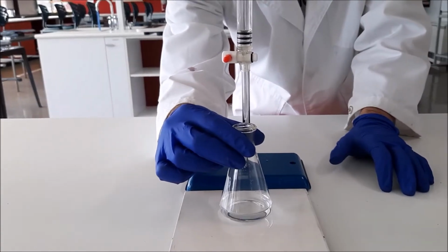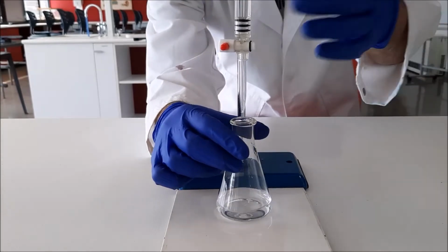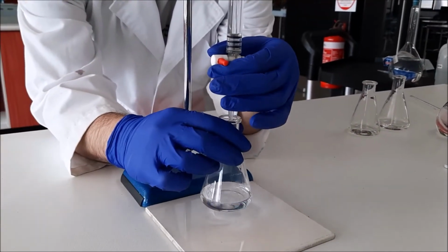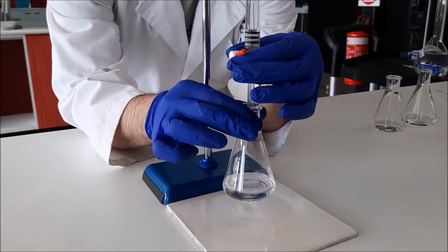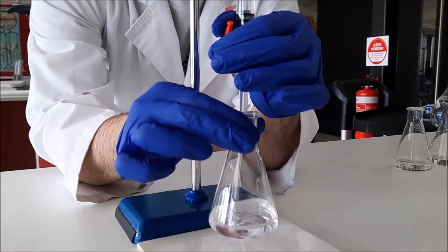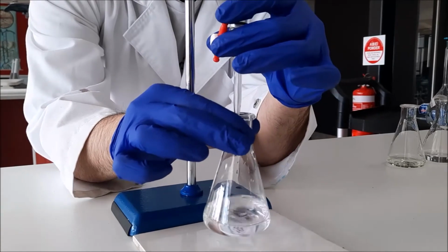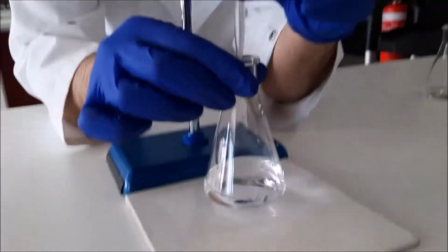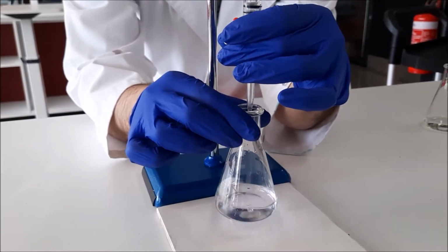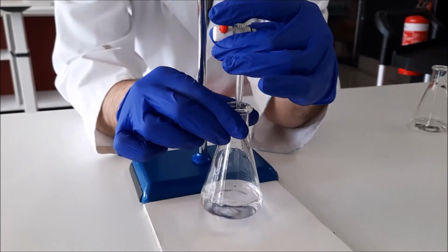So the correct way to do this is your preferred hand needs to be holding the flask. Again, we want it to react, so we're going to have to be able to just swirl it slightly with your other hand onto the stopcock, and you literally just need to open it slowly to allow it to start trickling out. So you want to do this a little bit at a time. Again, you can see some of the color forming. That's not what we want just yet. We want the whole solution to change. So again, just a little bit by a little bit until we get there.